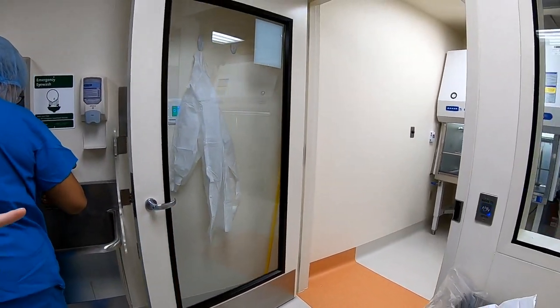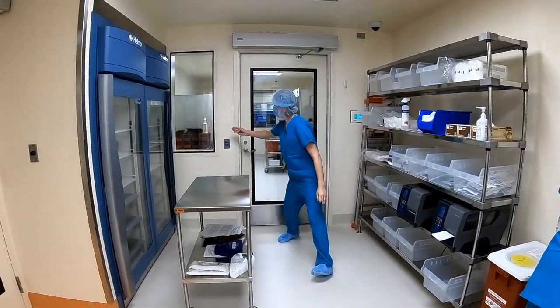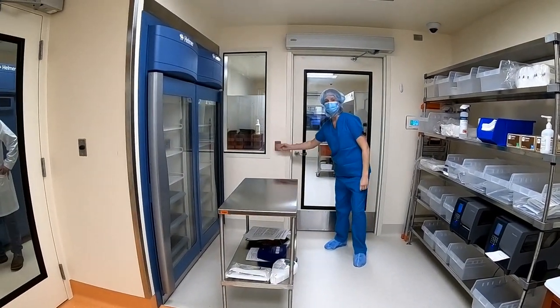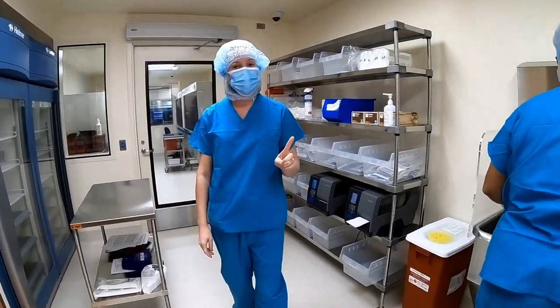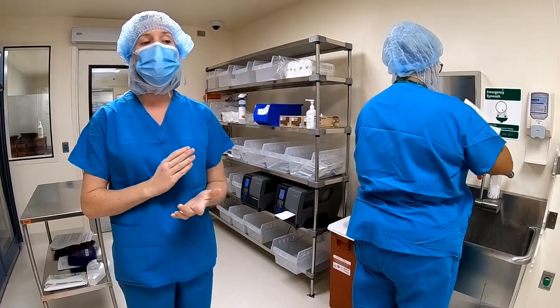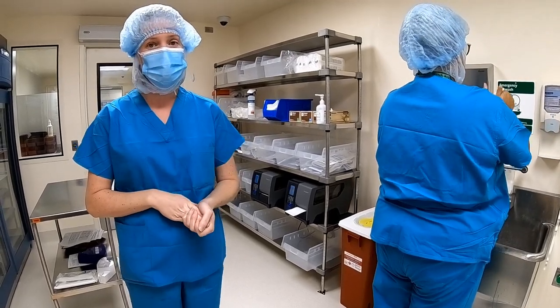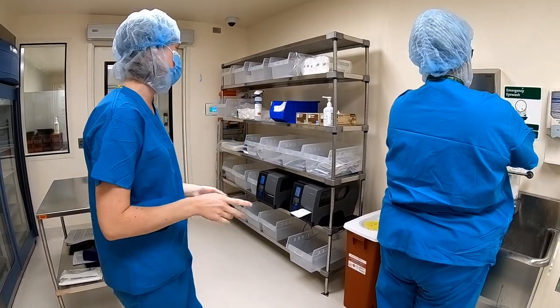When one door is open, the other doors cannot be opened — only one door can be opened at a time. In an emergency you can force push the doors open, but they're very heavy so you won't be able to do that on a day-to-day basis, only for emergencies.